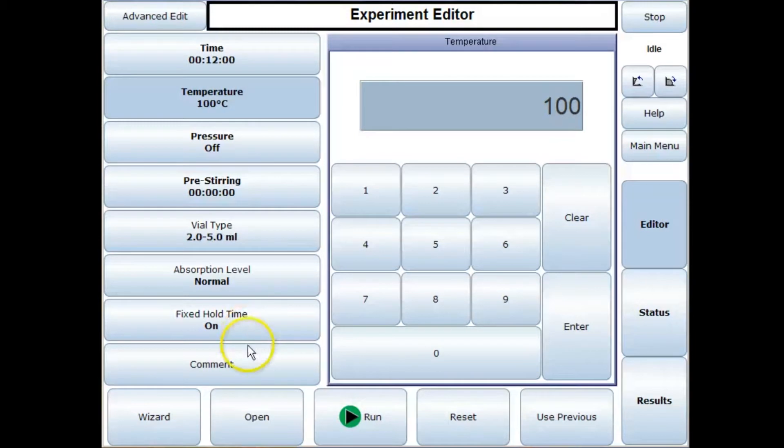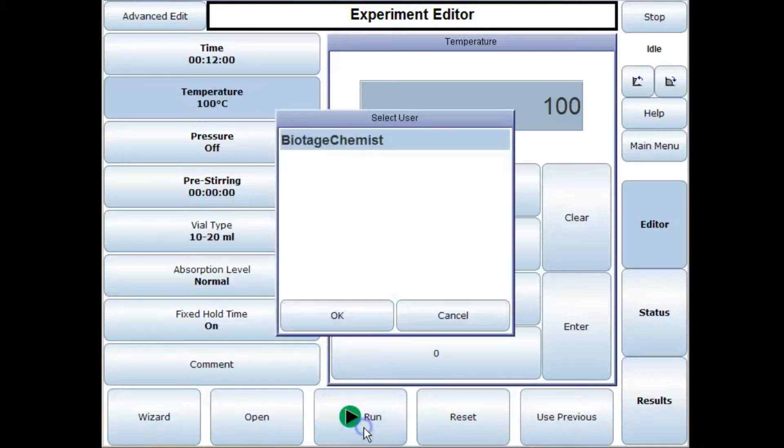A lot of these other parameters that you can set aren't necessary for each reaction, so we select our vial type, say 10 to 20 mils, and then we press go. We select our user.